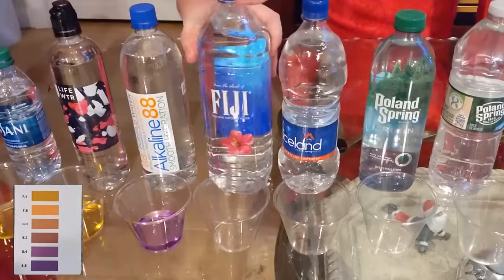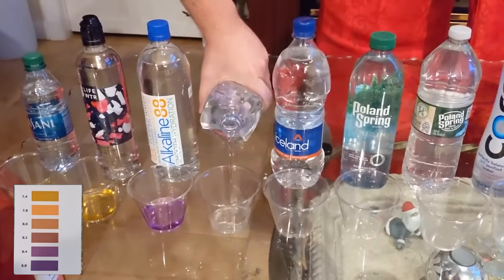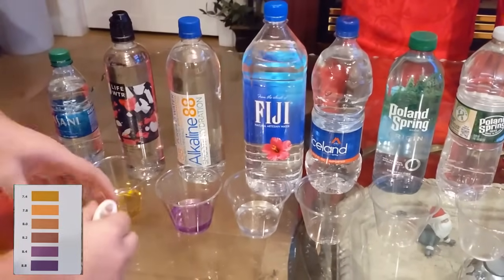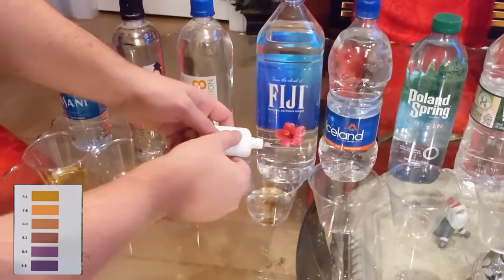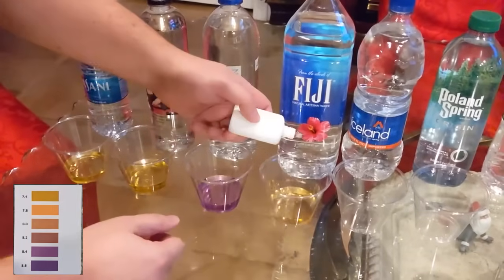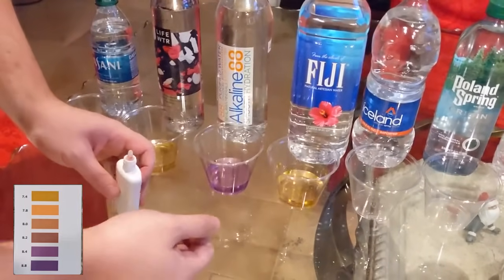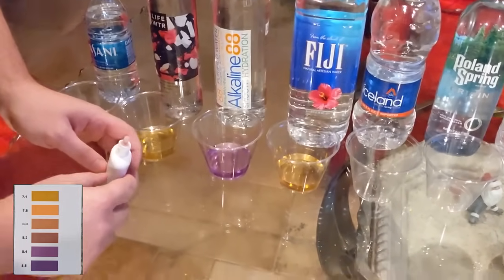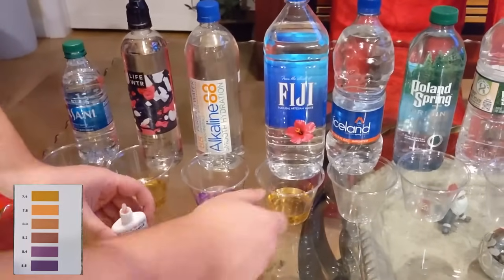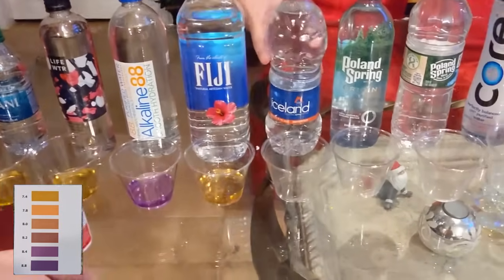Then we've got Fiji — really another popular brand. Spring water, supposedly from the island of Fiji, at least that's what it says on the bottling. Pour it a little bit in there. I used to like Fiji, then I stopped liking Fiji — I just kind of lost interest in the taste. This is coming back more on the darker yellowish side, which I'm surprised to see. We are using a higher pH, high-range pH test solution, so it's a little less forgiving if your pH is in a lower range.